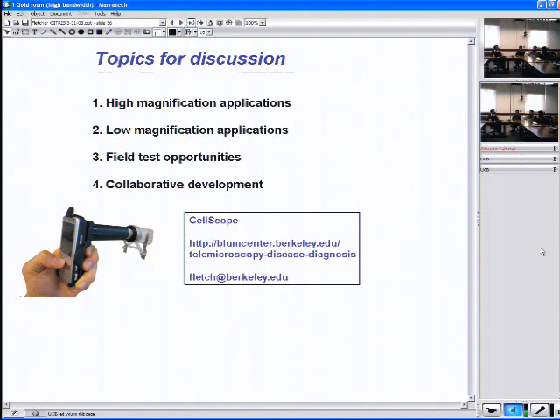And any fluorescence-based samples too, since LED technology is coming out so cheap and with so many wavelengths that you can easily think of adding filters. Sure, and do fluorescence-based microscopy as well. So bringing some of the contrast techniques that we're used to on the big microscopes to something much more compact.